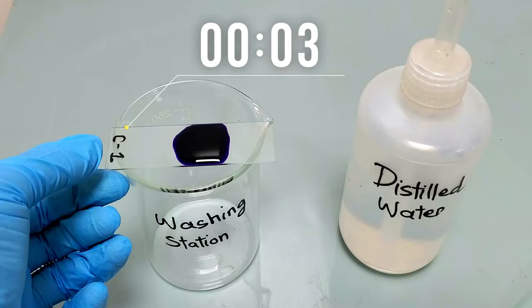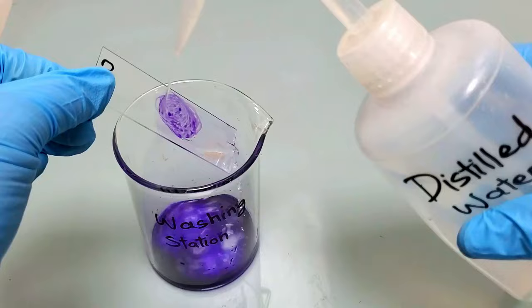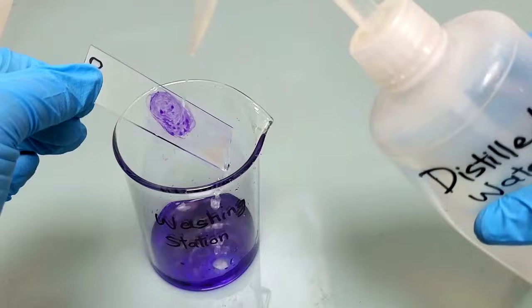After 1 minute of waiting, wash the slide properly, applying a gentle flow of distilled water. Primary staining is done.